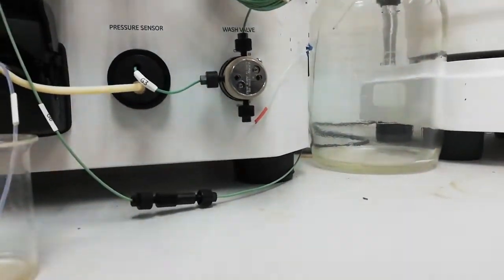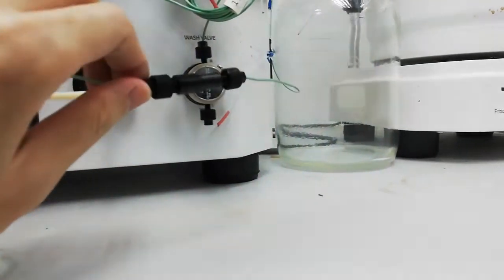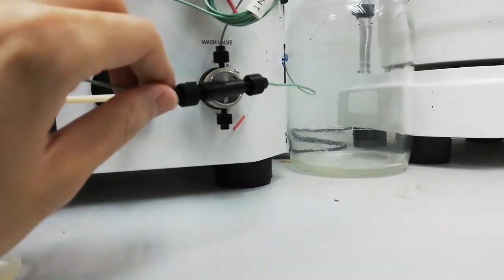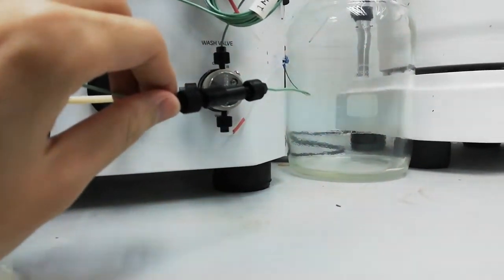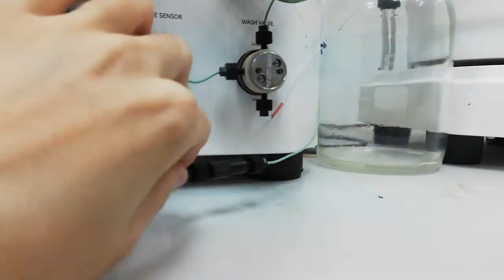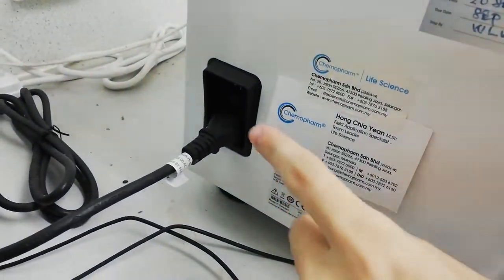The third part is the connections of the column. You are going to unwind this and then connect to your column. For me, I am using a straight corner connector. Last but not least, you have to switch on the button.